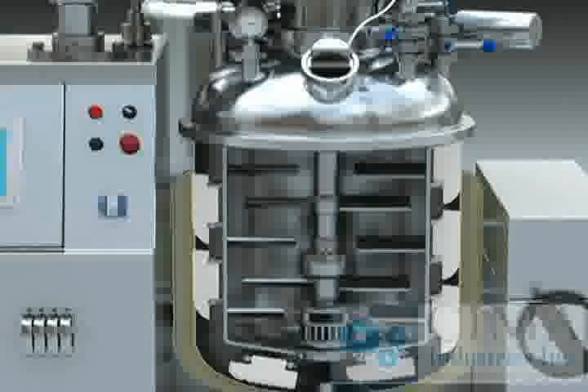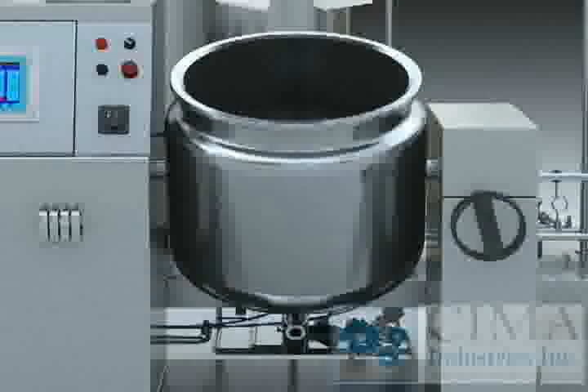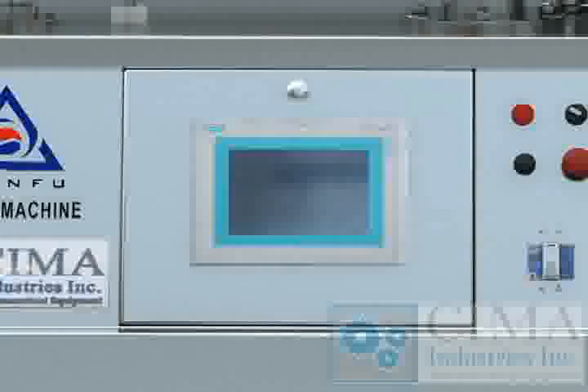The machine is made up of a pre-treatment tank, vacuum emulsification blending tank, vacuum pump, hydraulic system, pouring out system, and electro control system.